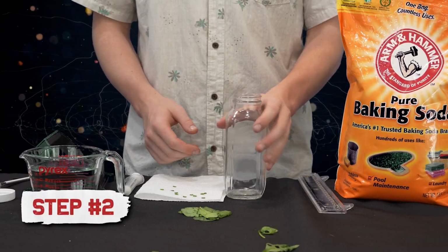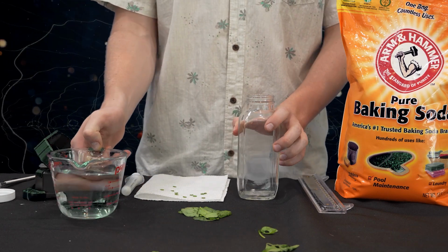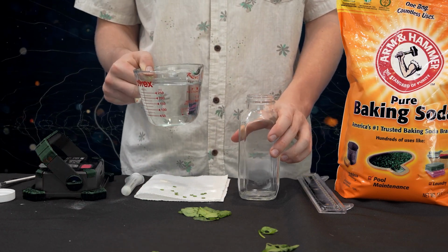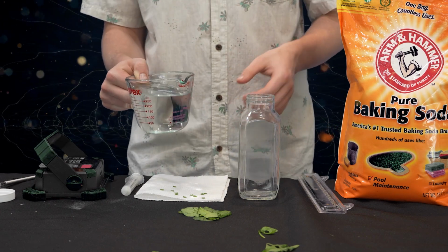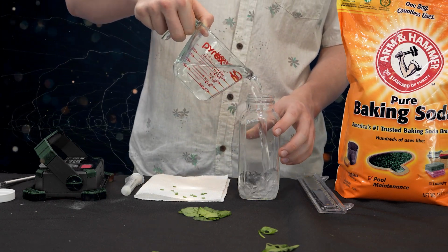Step 2 is going to be to fill up whatever container you're going to be using. It doesn't exactly matter how much water you're going to be using, because you just want to make sure you have some water that is saturated with enough sodium bicarbonate. In our case, we just want to fill it up.